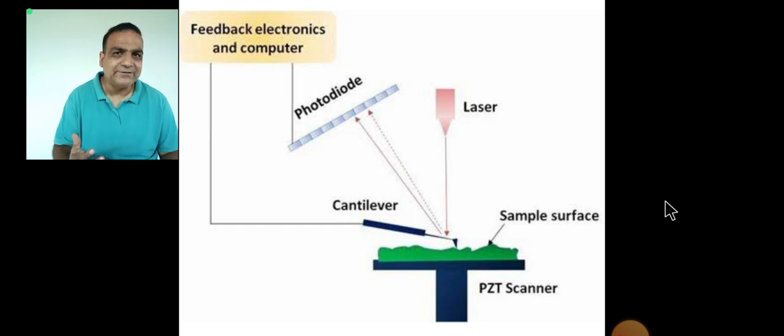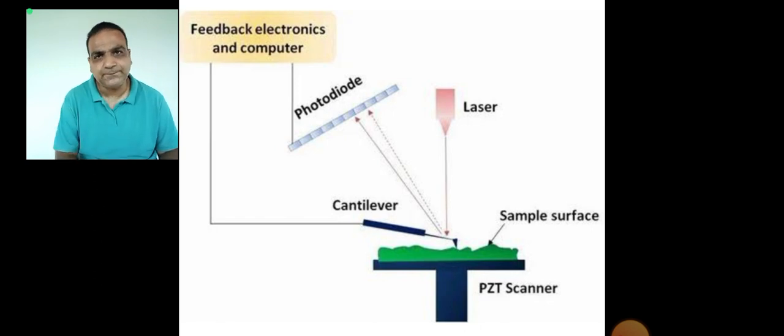to observe the materials, to observe their surfaces, to see the action of various atoms and molecules that are involved in some kind of structures. So microscopy, it's not the only tool that's being used in case of some particular field of science.